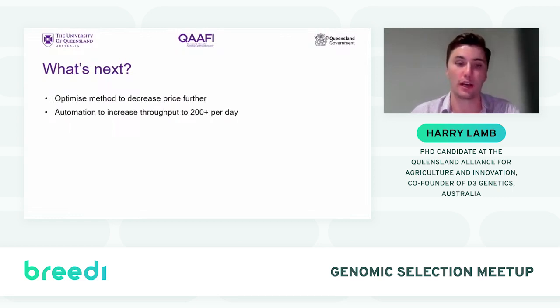We're looking for automation, like an automatic robot to do a lot of the sample prep, and this would potentially increase our throughput up to about 200 animals per day. We're also looking to optimize the methods further to decrease the price even more.